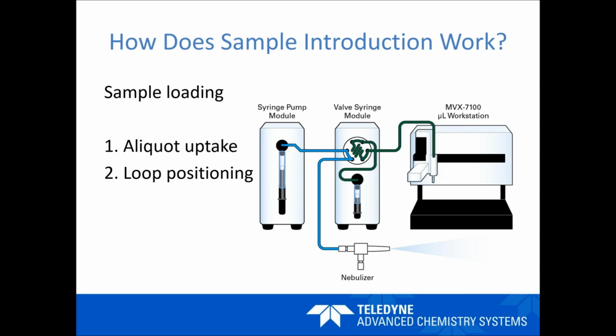And then in the meantime, you've got the green flow. At one end of that green flow, you've got your sample needle on the automation, and that flow goes via the 6-port switching valve, and at the other end you've got the short syringe. The short syringe will pull your sample through the sample needle on the automation, and position that sample on the 6-port switching valve sample loop there in the middle.